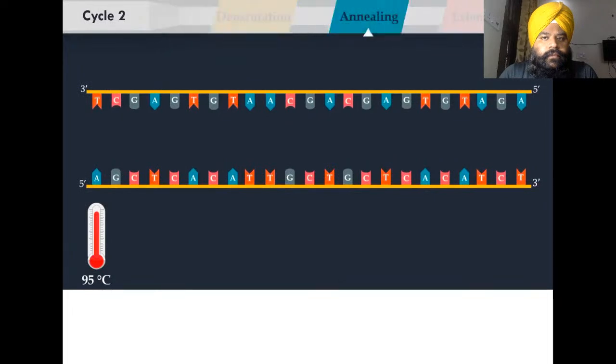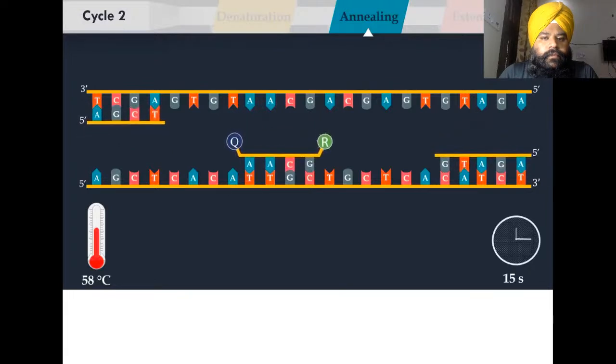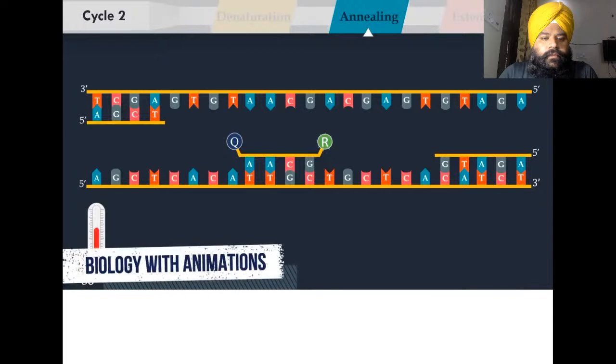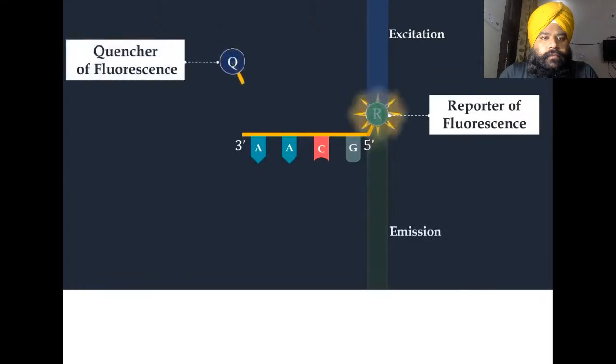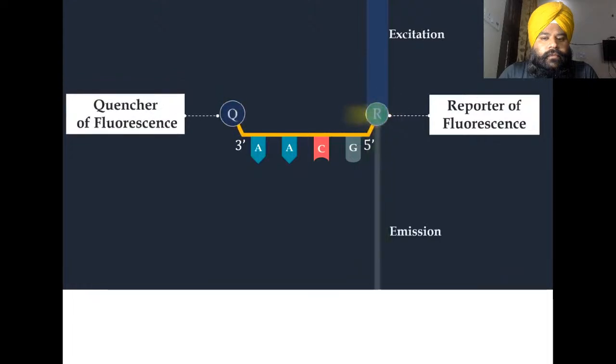In the next step, the reaction temperature is lowered, allowing annealing of the primers to each of the single-stranded DNA templates, and annealing of the TaqMan probe to its complementary part of the target DNA. TaqMan probe consists of a fluorophore covalently attached to the 5' end of the oligonucleotide probe. The fluorescence is emitted by the fluorophore when it is excited by the cycler's light source. Also, this probe consists of a quencher at the 3' end. The close proximity of the reporter to the quencher prevents detection of its fluorescence.